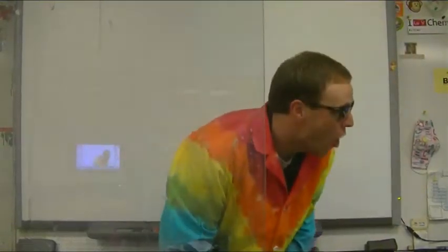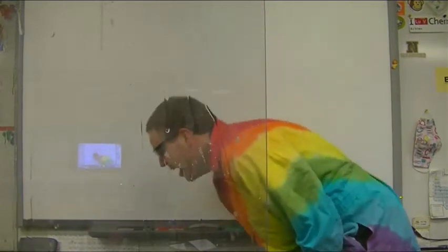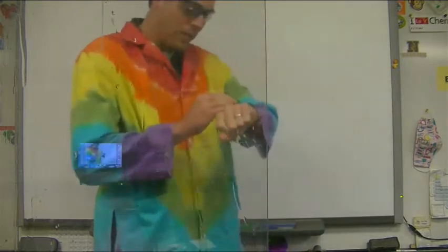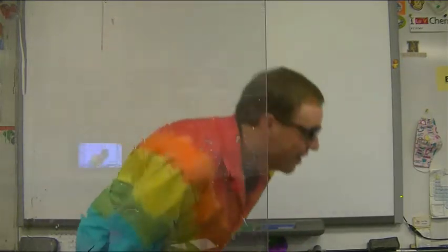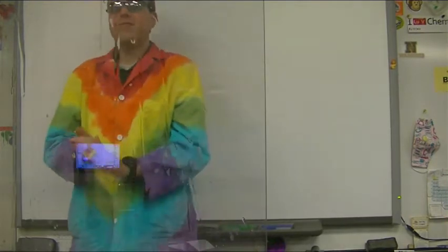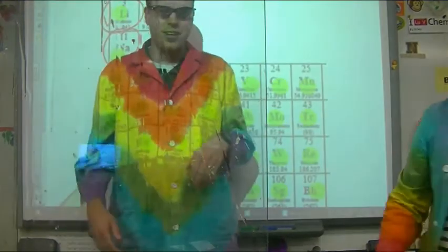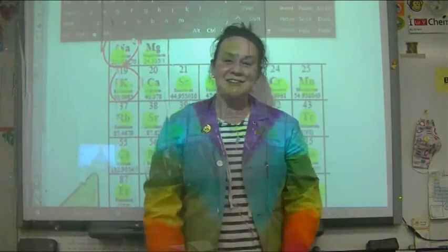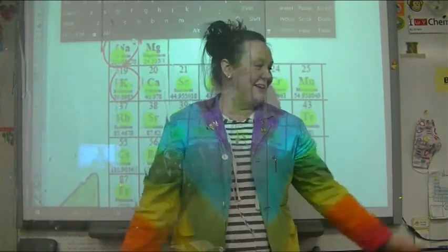Look around the room. Look around the room. Oh my gosh! Where's the flash shield, Mr. Pilcher? It's in between me and... oh my goodness! My heart rate's 123! Oh, over the flash shield. All right. Look at the room! Oh, I gotta change my pants! Oh! All right, guys. Well, thank you for coming.